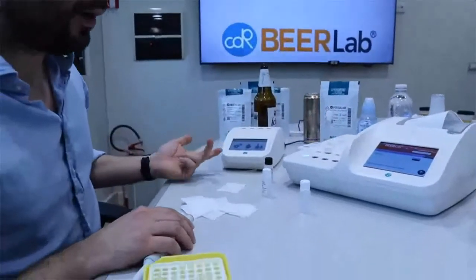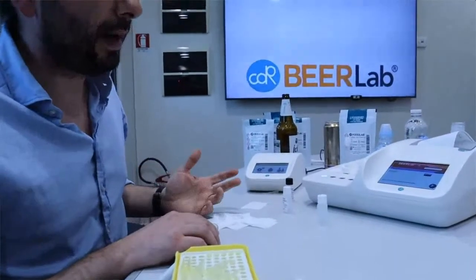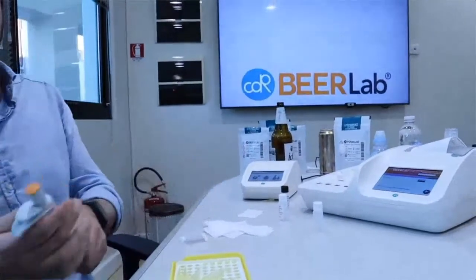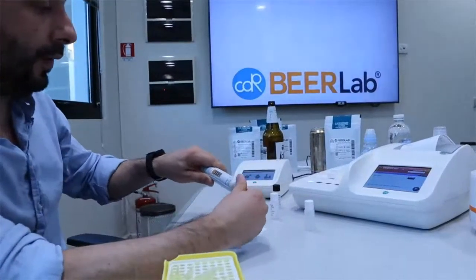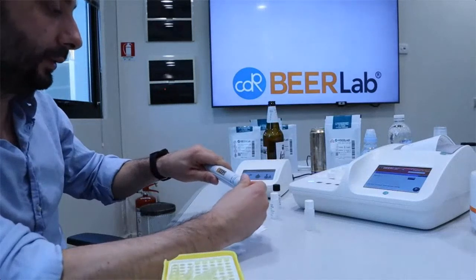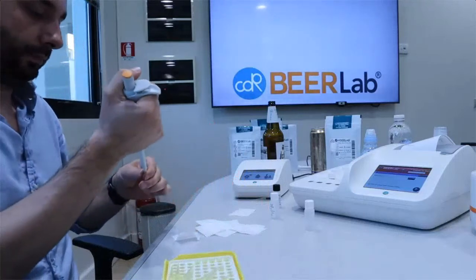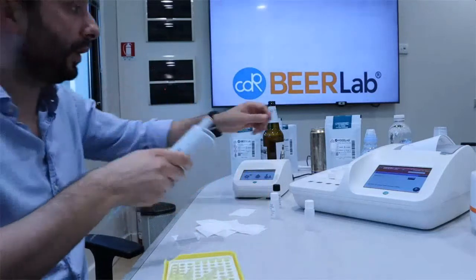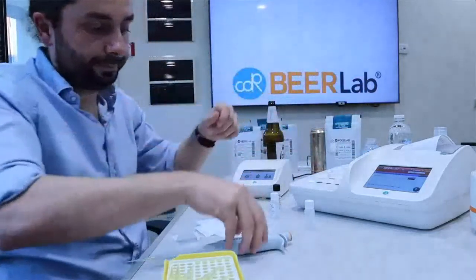On the screen now, it says you have to add 20 microliters of sample. So we change the volume of the pipette, and we collect the sample. The first one.